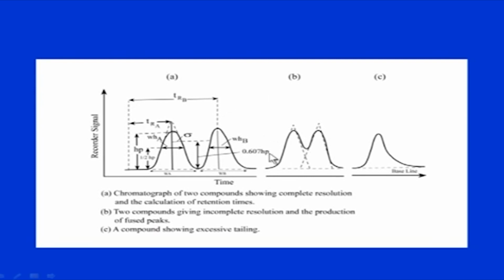For example, HPLC will give you a very high resolution separation and very good peaks, that is completely separate peaks, as compared to a simple gravity run chromatography system. There could also be other problems. If you see here, there is peak tailing, and there could be fronting also, where peaks are not very sharp and they drag, and you do not get a very good purification.